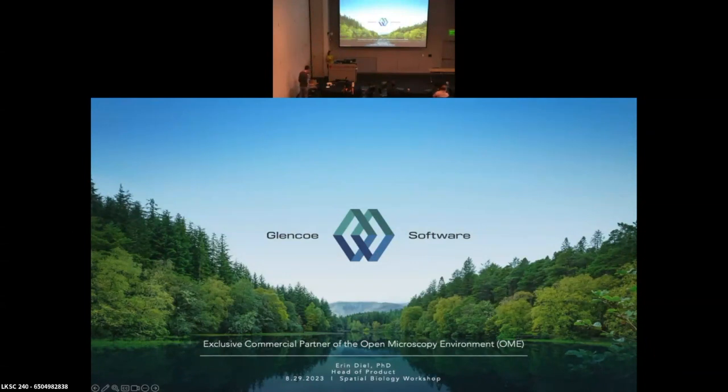And then I'd like to finish by showing you briefly some sample data sets that we've loaded into a demo system that we'll have up and running throughout the meeting. And so if anyone has any particular questions or wants to see the system in action, I'd be happy to take you through that. Okay, so let me start my timer. Great.